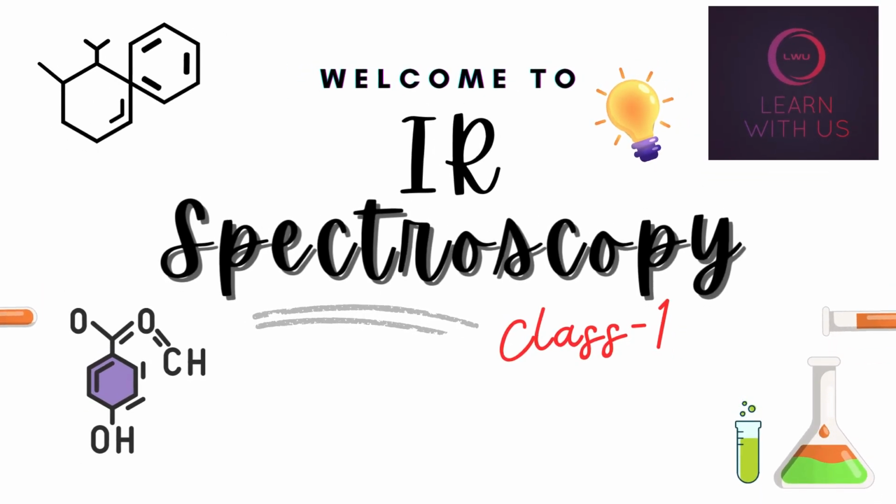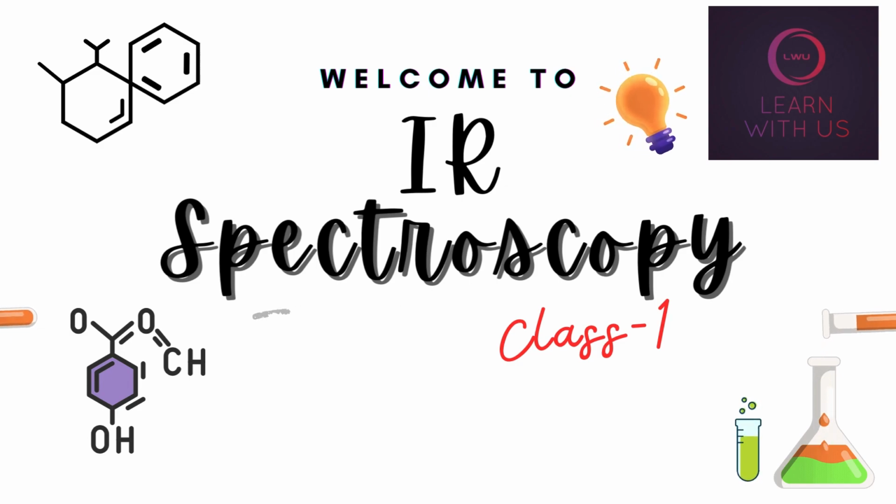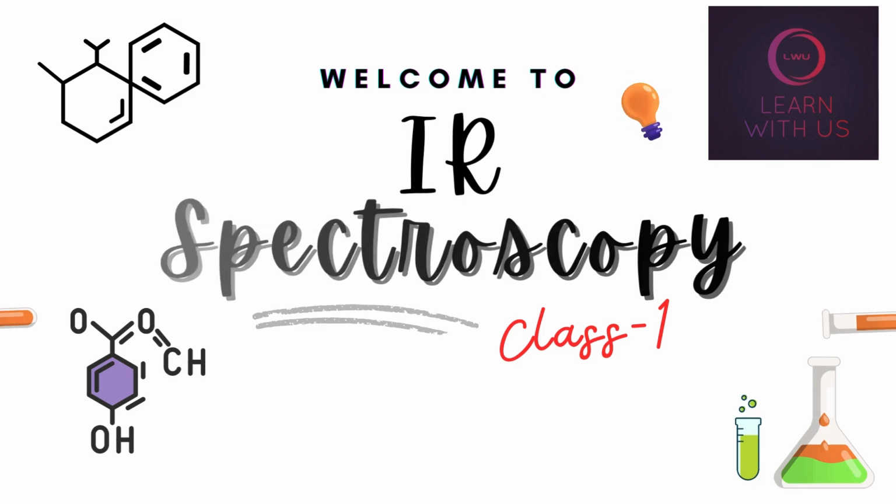Let us learn how to identify the organic compounds using IR spectra. What are you waiting for? Come learn with us.